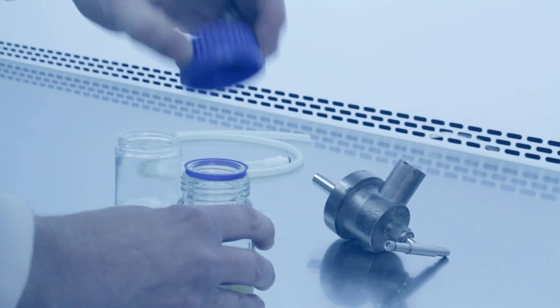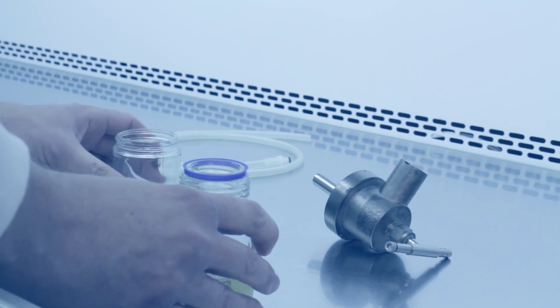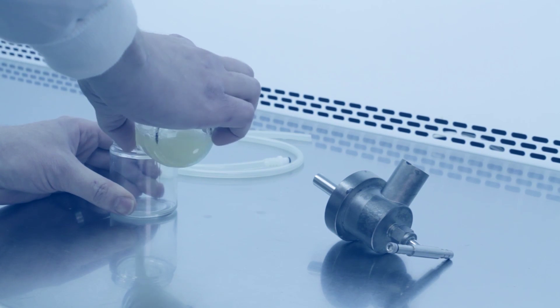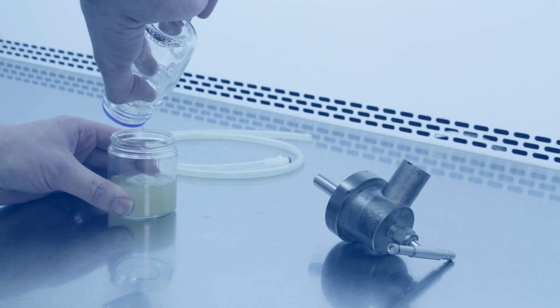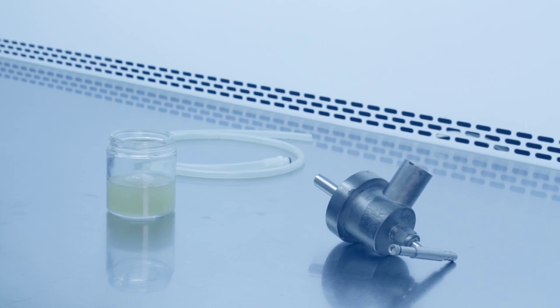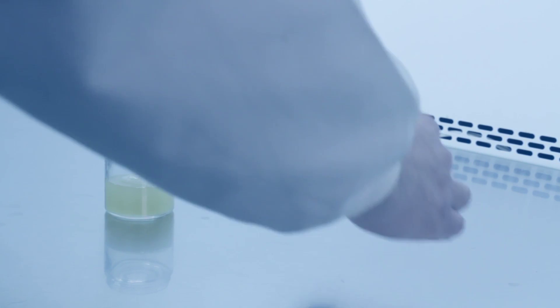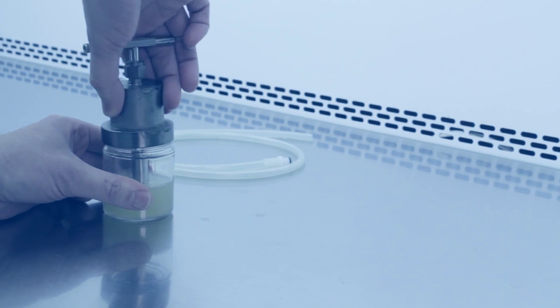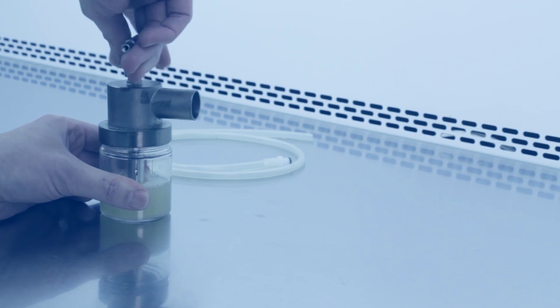We tested various workstations, including a non-HEPA model to provide a comparison. We used non-spore forming and spore forming bacteria, which were prepared as dense suspensions and aerosolized into the internal atmosphere of each workstation using a nebulizer.